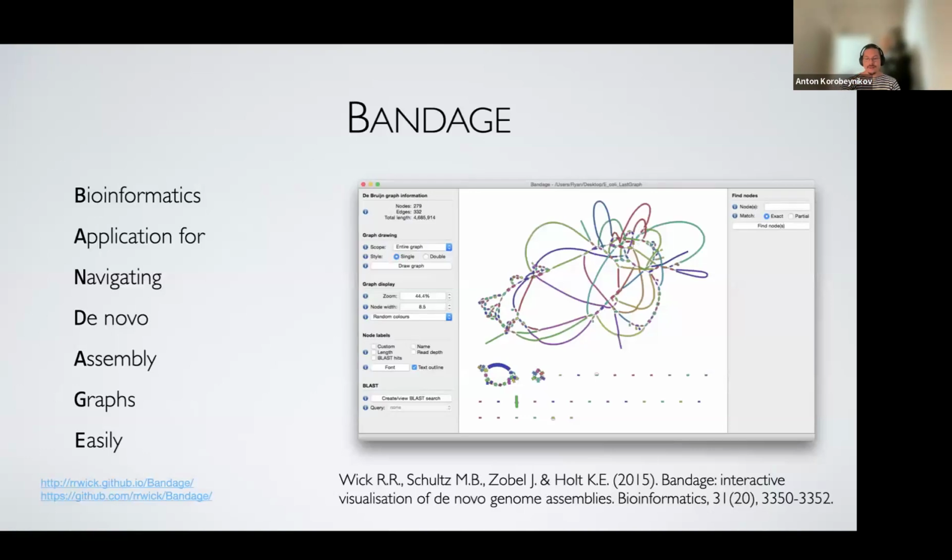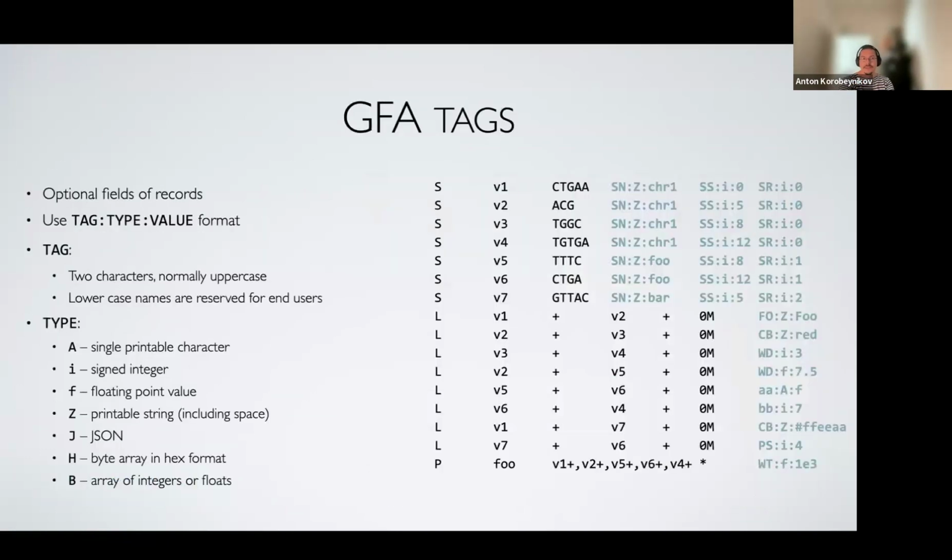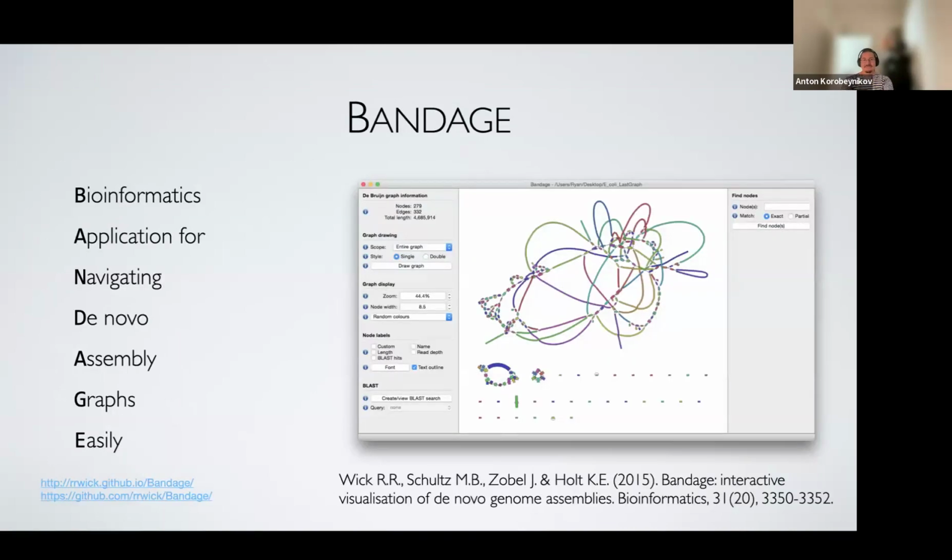So yeah, this is pretty much the quick introduction to the GFA format. It's not scary at all. All right, so let's proceed to the tool itself.